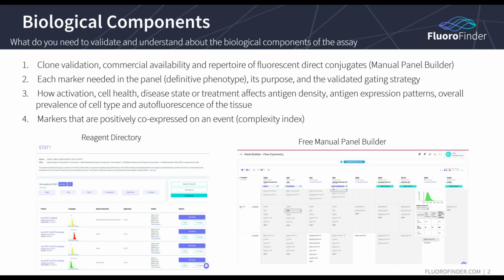And some of that you can get from the literature, and some of it you can get from using more advanced software, things like VISNE and TSNE, which are called dimensionality reduction software. What that helps us understand is, what did we lose when we shut down or limited how we gated towards a subpopulation? Was there anything that we missed because we were tunnel-minded in believing that we understood where our biology was going?